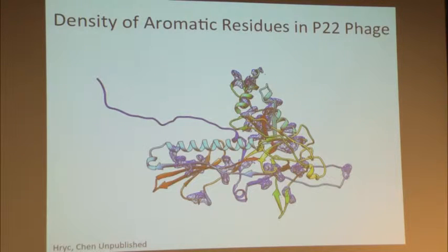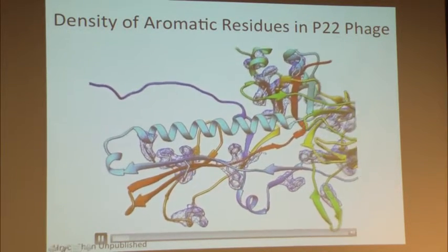Okay, so at the end, we have the final image map. From there, I would like to show you some of the really good looking side chains, which are the bulky side chains. Here is the backbone, and I'm putting the density with all the aromatic side chains in here. And you can see how good this match is.